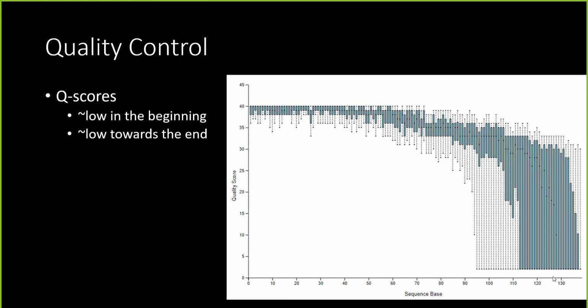I think I might have sent you guys a paper on that, one that discusses what different settings to use. Now luckily for you, the default version that QIIME2 uses is perfectly fine for most cases. For other ones, you might want to adjust the settings by different runs, and generally you do that by having your mock bacterial data set as a part of your sequencing steps.